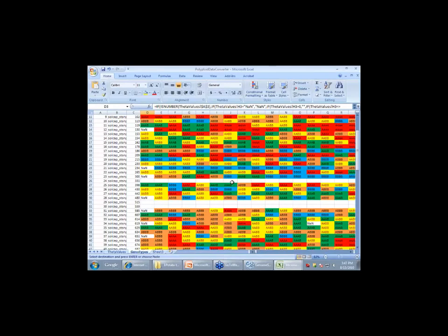Proprietary software: how do we as users have access to Genome Studio? The way we're set up right now, at least with the SolCAP chip, is that you have to be able to access an Illumina lab, and it doesn't have to be our lab. It could be your own lab or a third party.